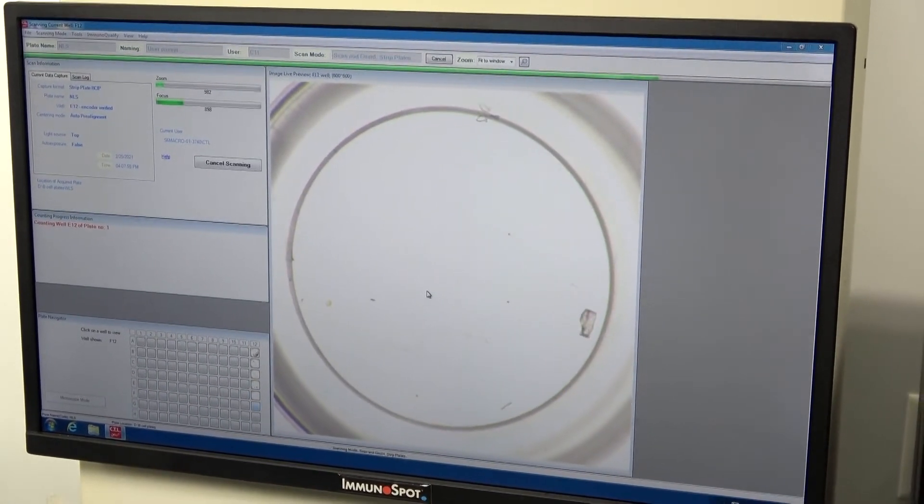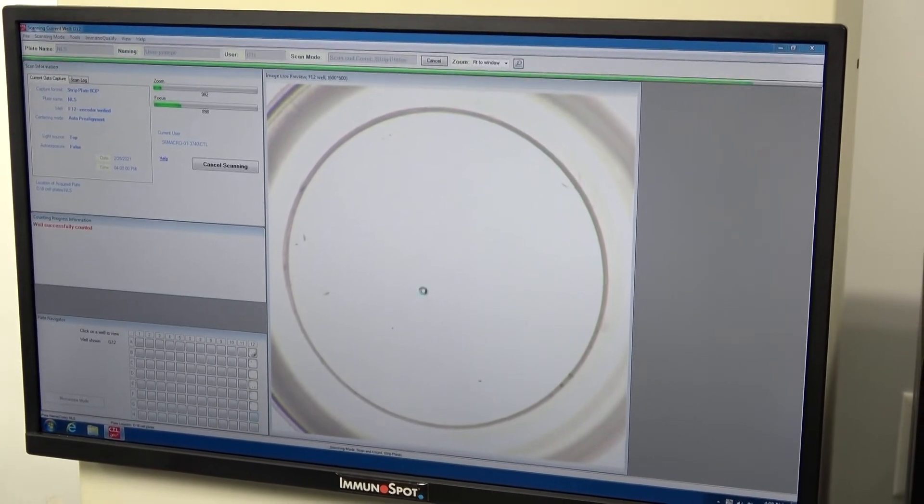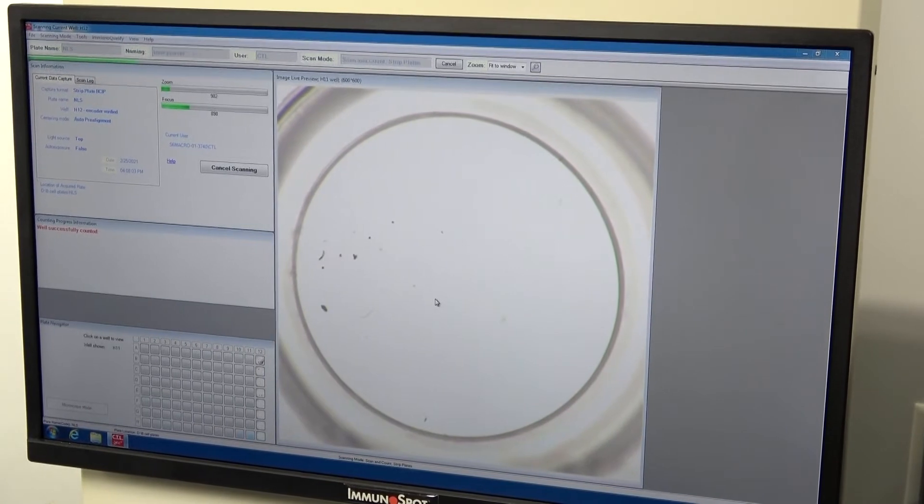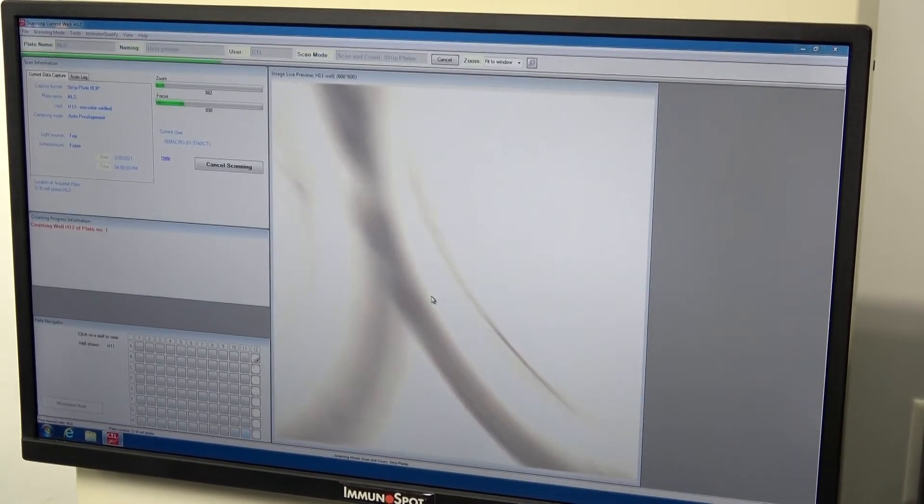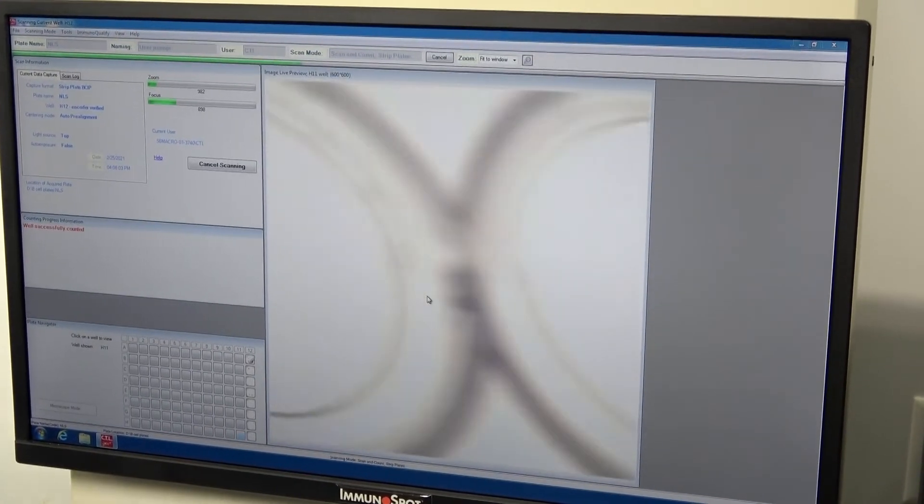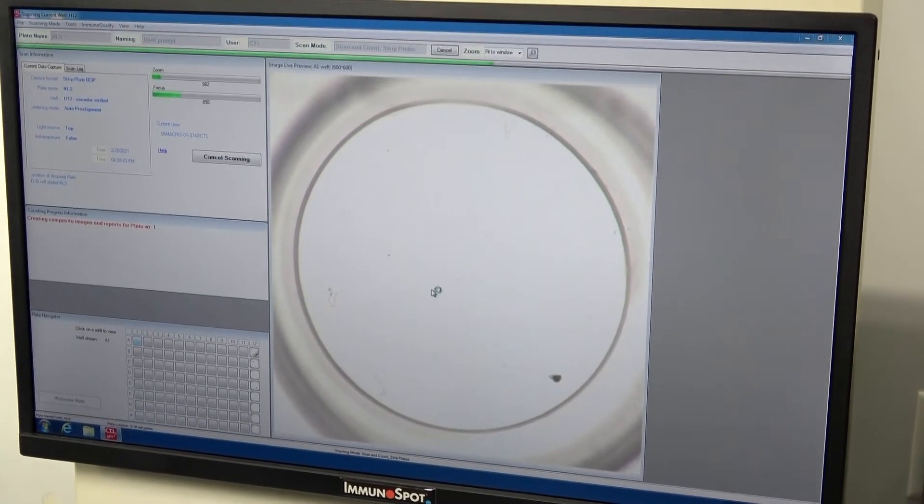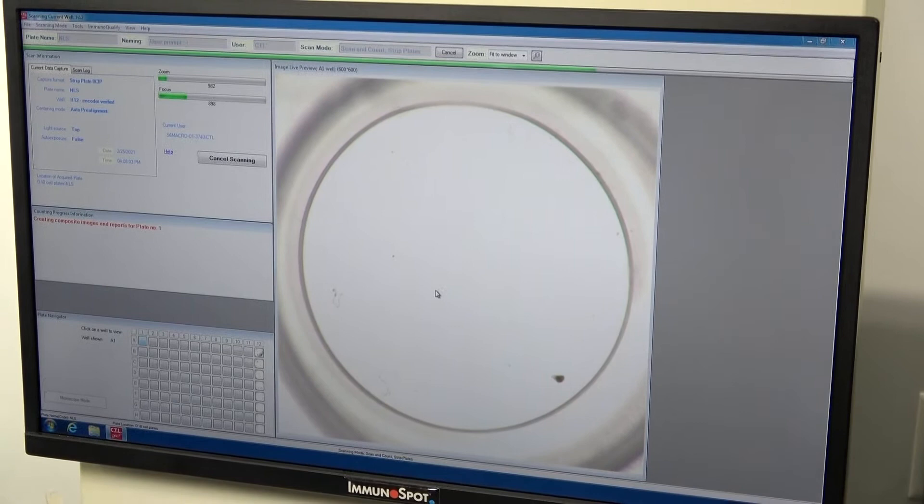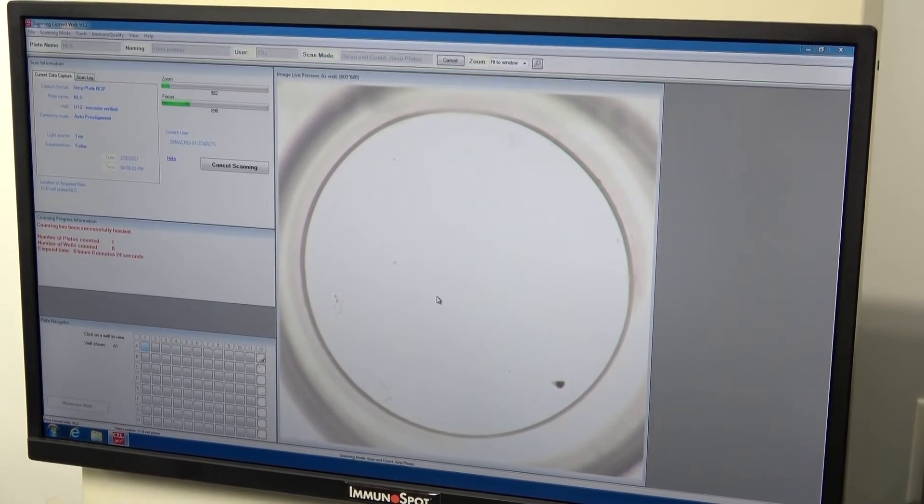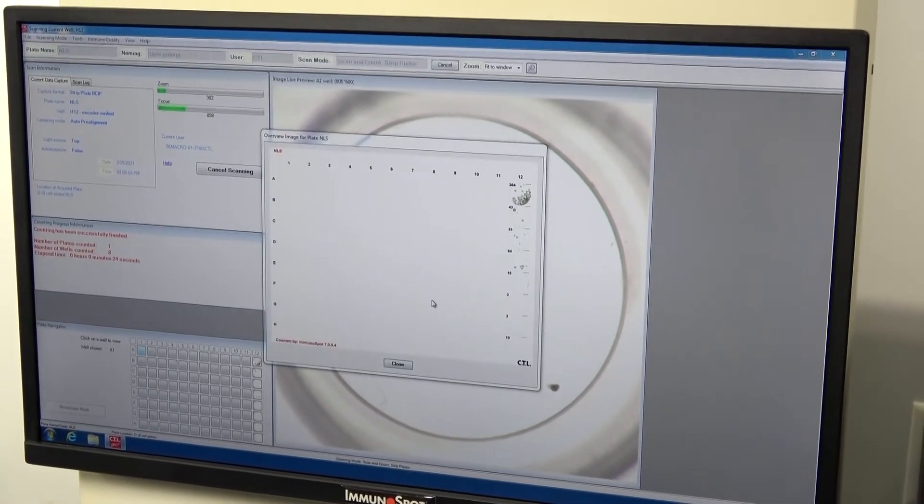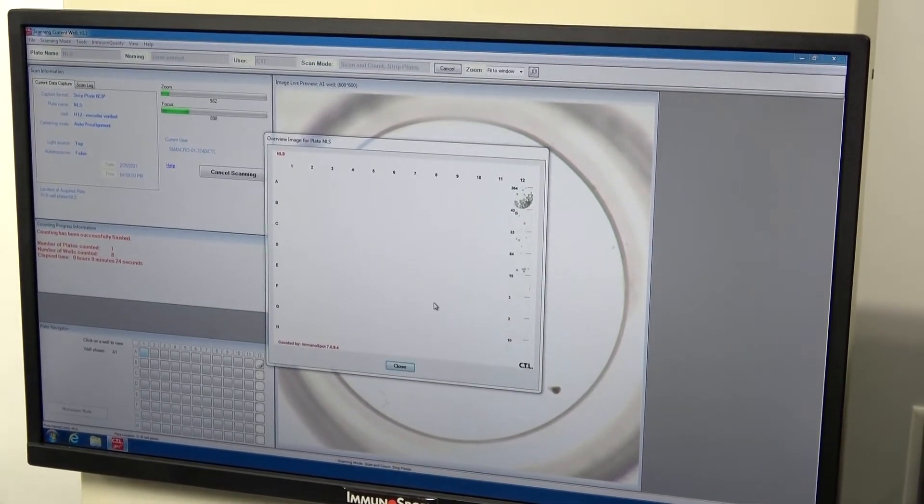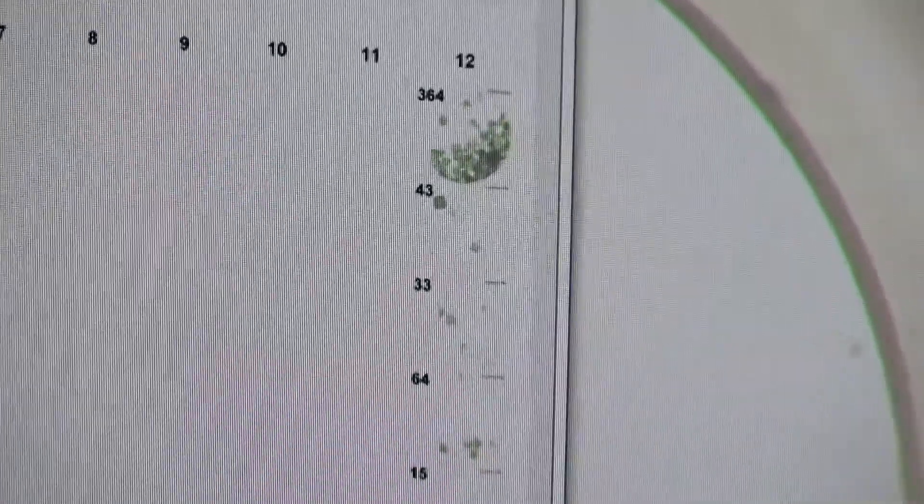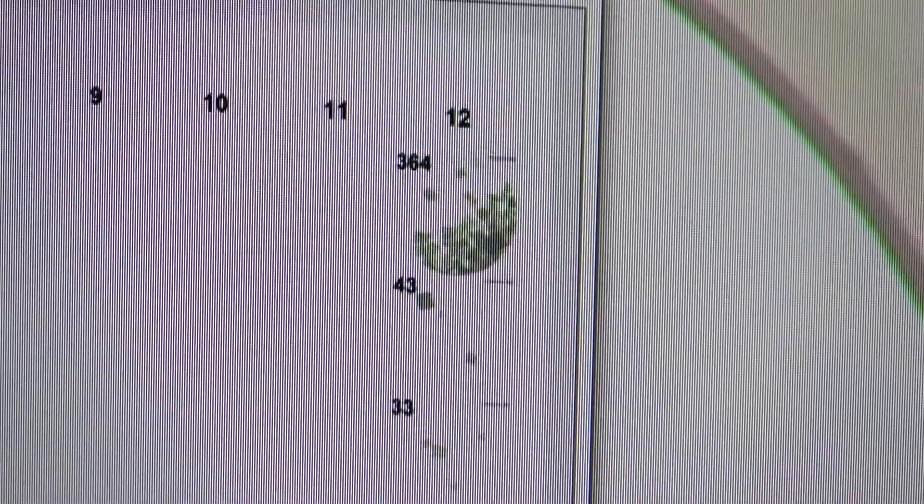It's going through an auto focus on each well, so that if you have various liquid heights, it's going to auto focus. There it gives us a graphical representation of what it found in each one of those cells.